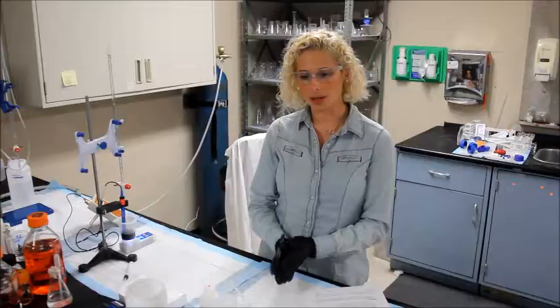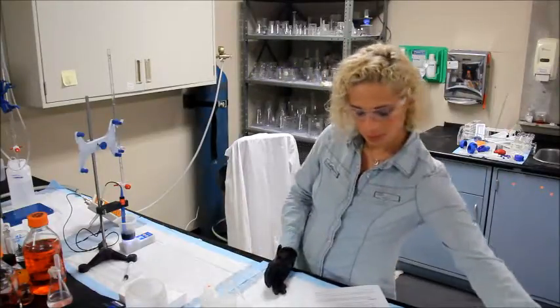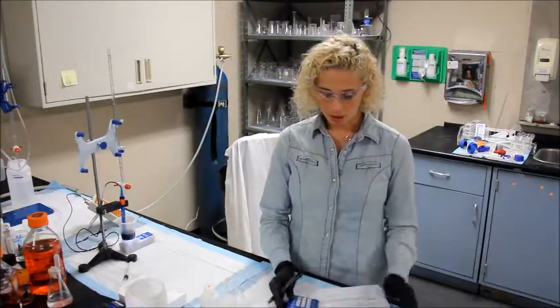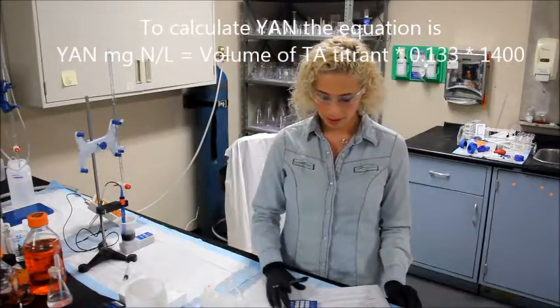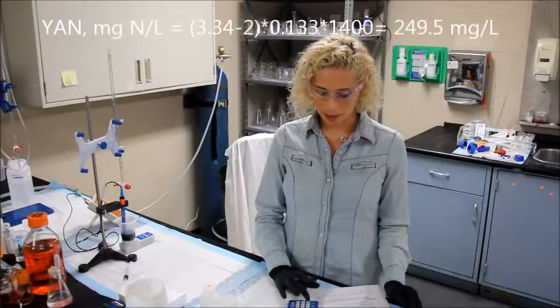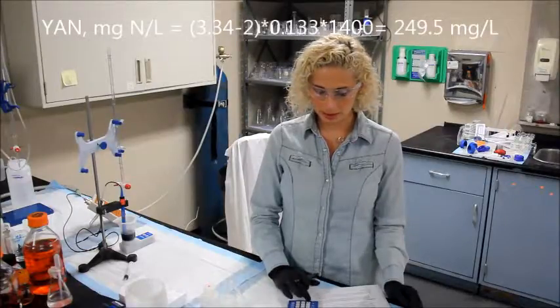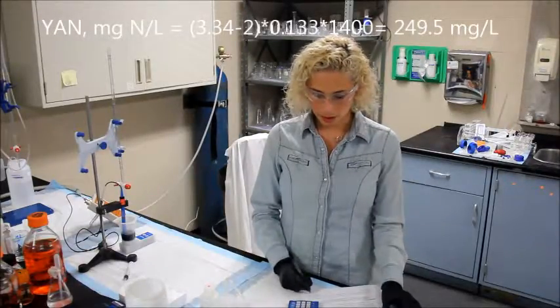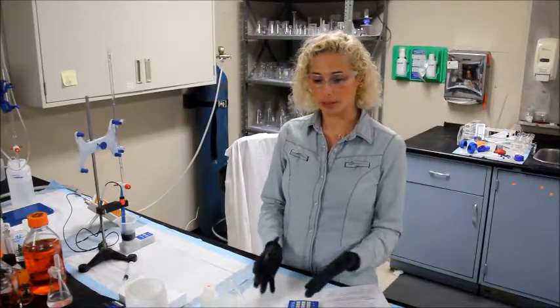To calculate your YAN, or milligrams of nitrogen per liter, you simply take the difference in your change of volume. So that would be 3.34 minus 2, multiply that by 0.133, multiply by 1400, which gives me 249.5 milligrams of nitrogen per liter.